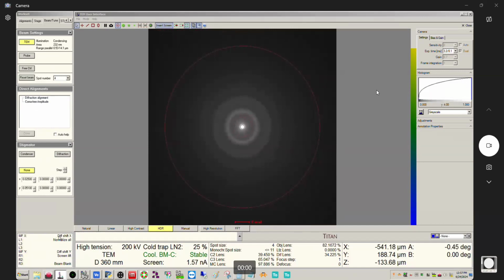That's basically the same thing as what the default setting is when I go into diffraction mode, okay? Although what this does is recall the center position. That's what I'm doing here. I'm recalling a center position. But if I click on coma-free amplitude, okay, now you can see my multifunction X knob. Watch what happens. As I turn this clockwise, I see the pattern separating, okay? And basically the direct spot is bouncing back and forth between these two extremes.